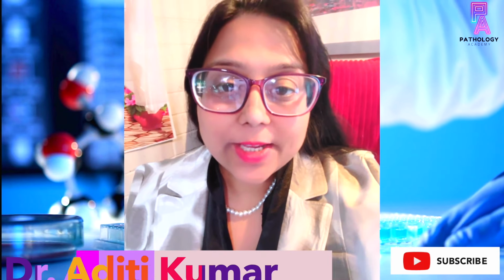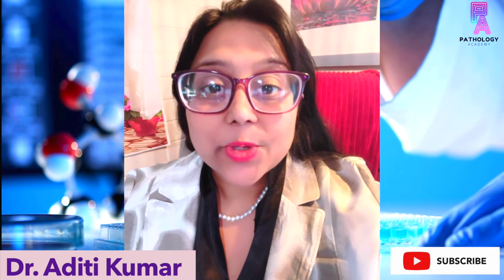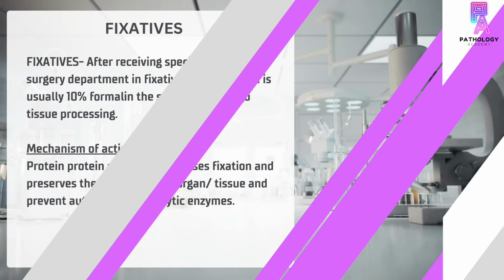Hello friends, in today's video I will be talking about tissue processing technique in detail. So let's get started. Fixatives.